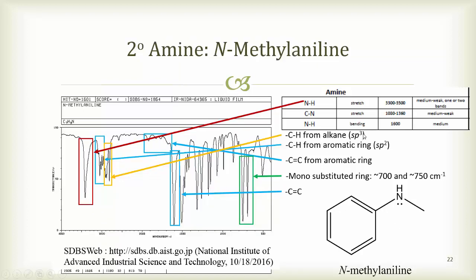And again, if you really want to go looking for it, there's the carbon-nitrogen single bond, but look how many peaks are in this region. That's getting really hard to interpret, so I don't usually try and go and find that bond.